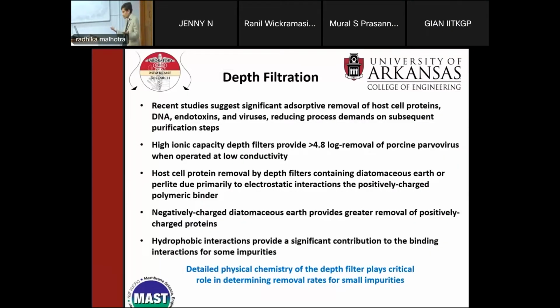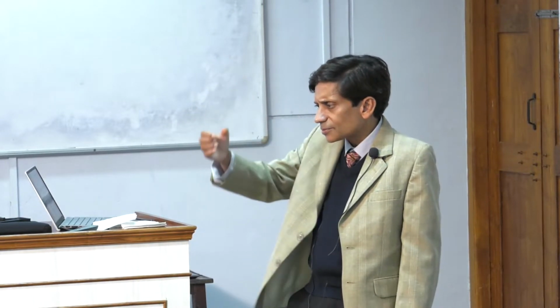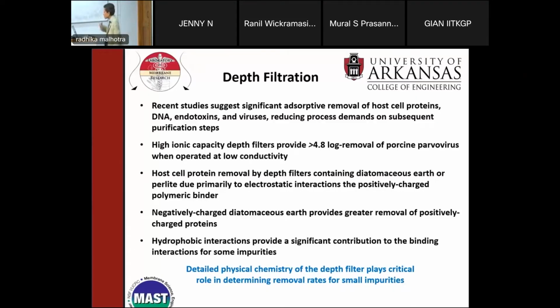As well as being a depth filter, they are starting to remove some of these contaminants that occur in biomanufacturing. And if you remember that diagram I showed you, you have a capture step and then you have two polishing steps. And I told you sometimes people try to see if they can get away with one polishing step. That may be possible if you can design depth filters that start to remove some of these contaminants.